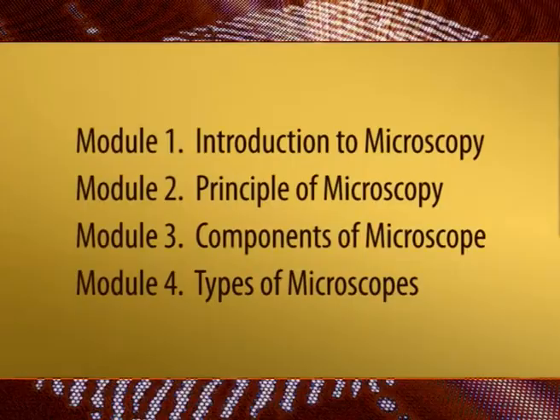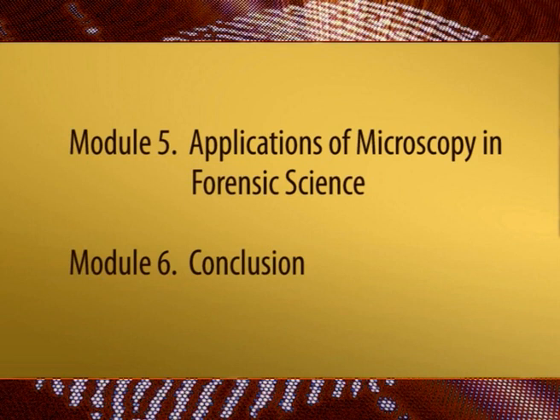Dear students, let us have a look at the modules which we are going to study today. The first one is Introduction to Microscopy, then Principle of Microscopy, Components of a microscope, types of microscopes, applications of microscopy in forensic science, and then in the end the conclusion.